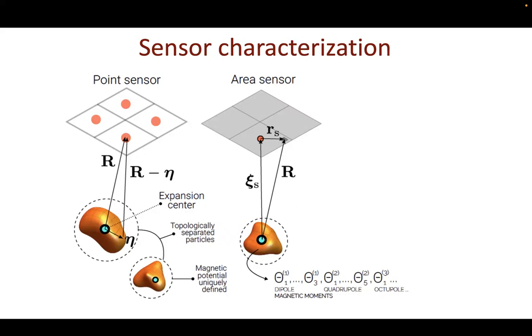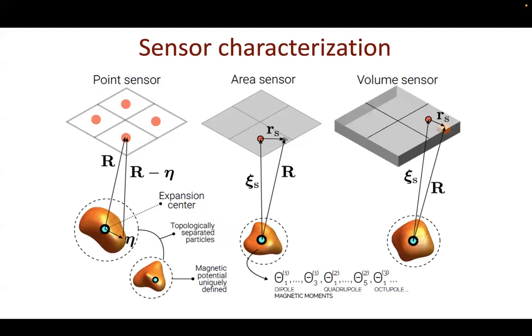But then these QDMs have a diamond chip where there is a layer of NV centers. And in the diamond chips that we generally use for geological applications, this layer can be more than a micron thick in itself. So that's when my postdoc said, well, if I'm programming 2 integrals, I can also make it 3, and then we have a volume sensor. So for our inversions, we consider the sensors to be a volume.